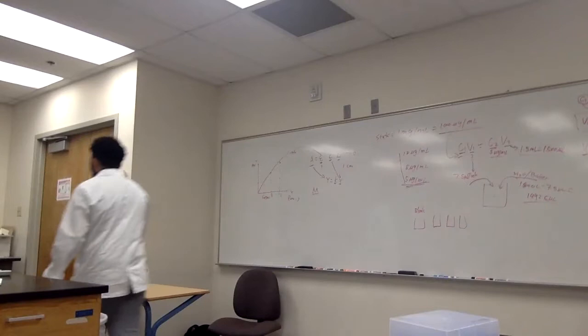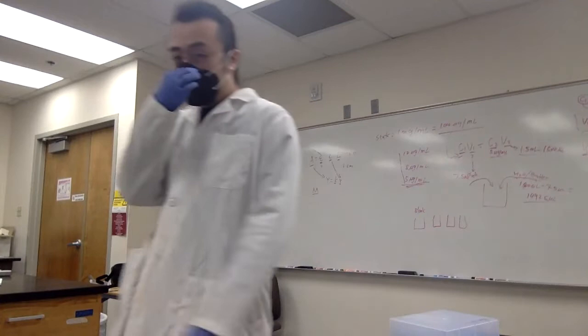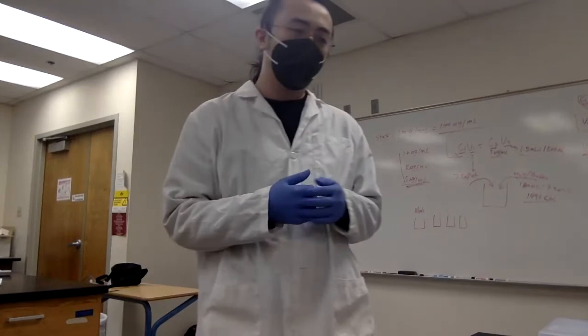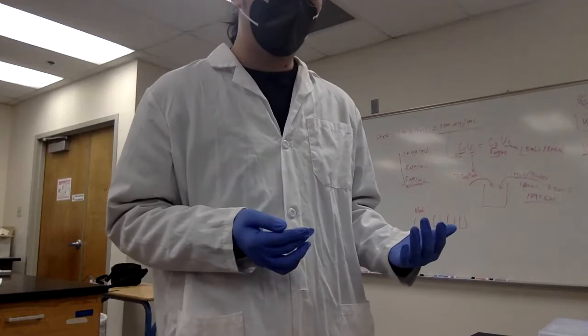Now it's my turn. Second part. For the first part, I will get his result and send it to you. So the second part is more interesting. The purpose of the second part is basically to show you guys how to use the spectrometer, to show something about spectroscopy. We use spectroscopy to usually measure the concentration of a specific molecule in a solution.